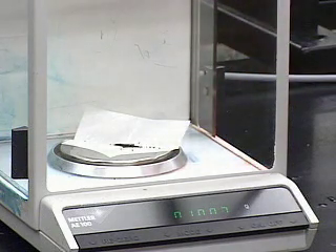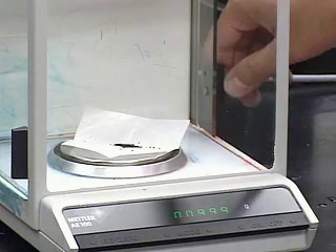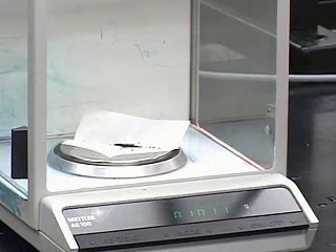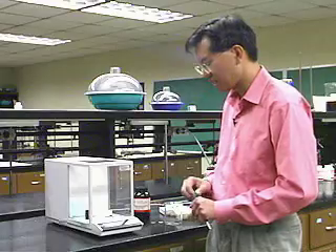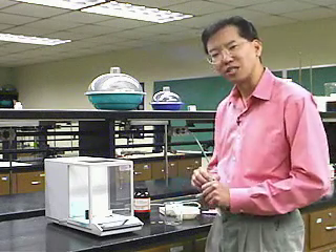To get the actual measurement, slide the door closed and record whatever value is read out. In this case it looks like 101 milligrams — 101.1 — so it's settled down. That's how you would weigh something when you need a relatively small amount.